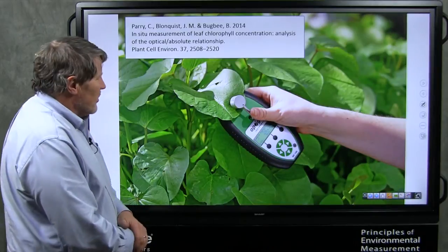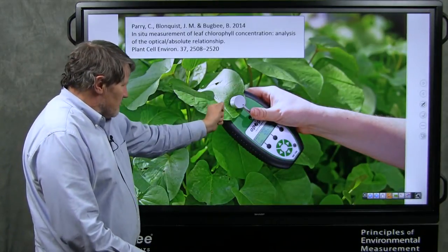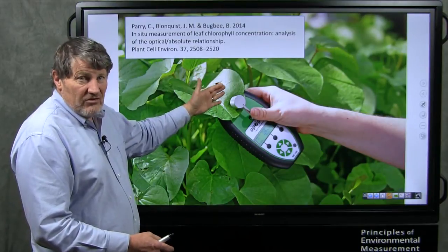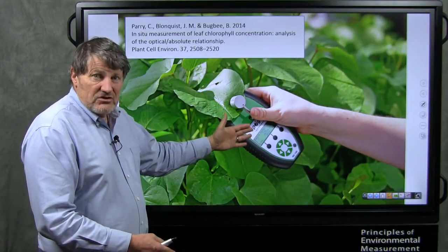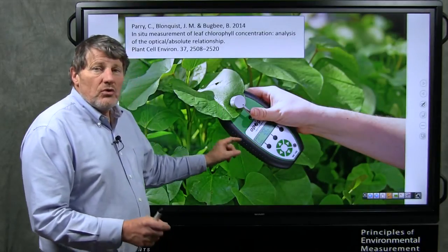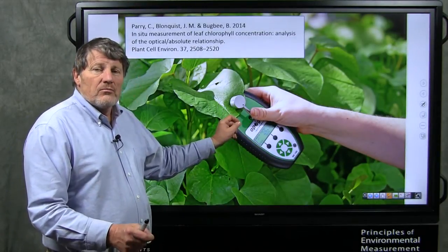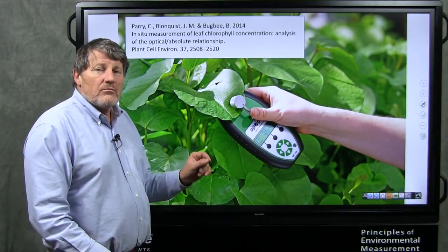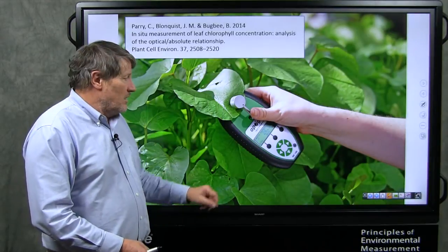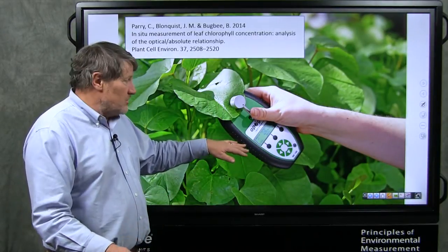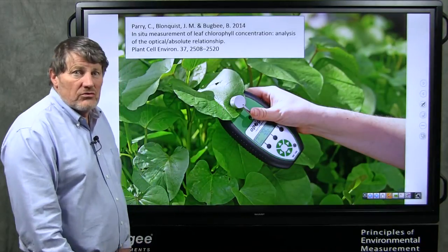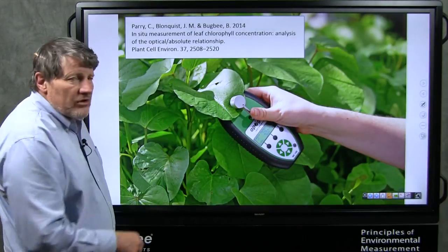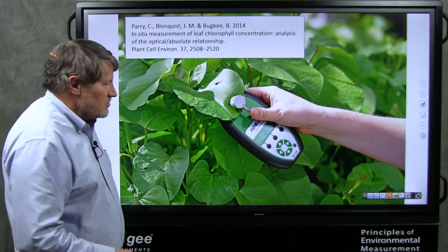So here's the meter on a leaf. It's an optical meter. You clamp it down. Based on the transmission of two wavelengths of light, it converts this in software to a unit of chlorophyll per unit area. In this case, it's moles of chlorophyll per meter squared of leaf. No other optical meter in this price range can do that. That's the unique breakthrough of this meter, but it was not trivial to get to that point. So let's walk through some of the graphs and look at what we did.